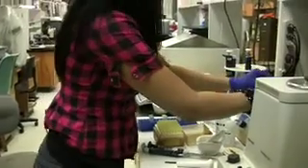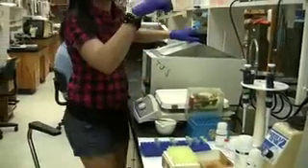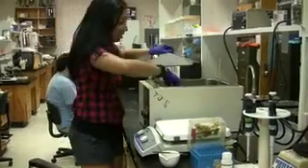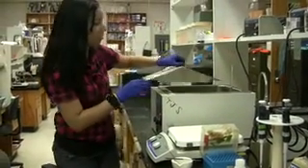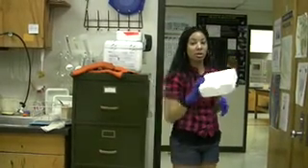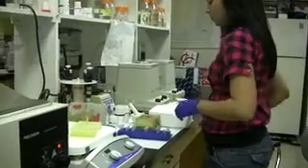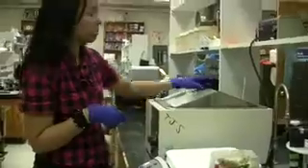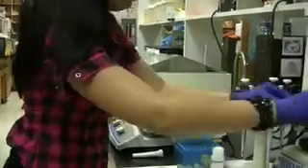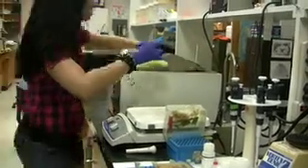Now we'll vortex them. We'll put them here and now we'll place them in the incubator for 10 minutes, mixing them about every 3 minutes. While my samples are incubating in the water bath, I'll go ahead and prepare some ice for the next set. Then I'll vortex again and place them back in the incubator for the rest of the 10 minutes.